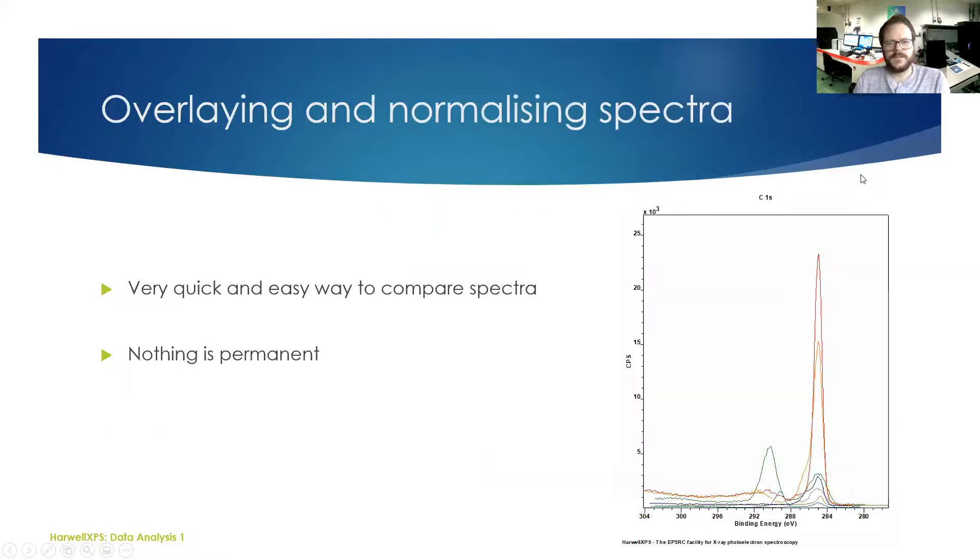We're just going to talk about some overlaying and normalizing you can do with Casa or XPS. It's a really good way to visualize differences in your spectra. For example, here we have a bunch of carbons overlaid and we can see that some have higher energy peaks, some are single peaks, some have multiple peaks. None of these are permanent changes. You can toggle on and off overlaying and normalizing. It's just a really nice way to help you visualize.